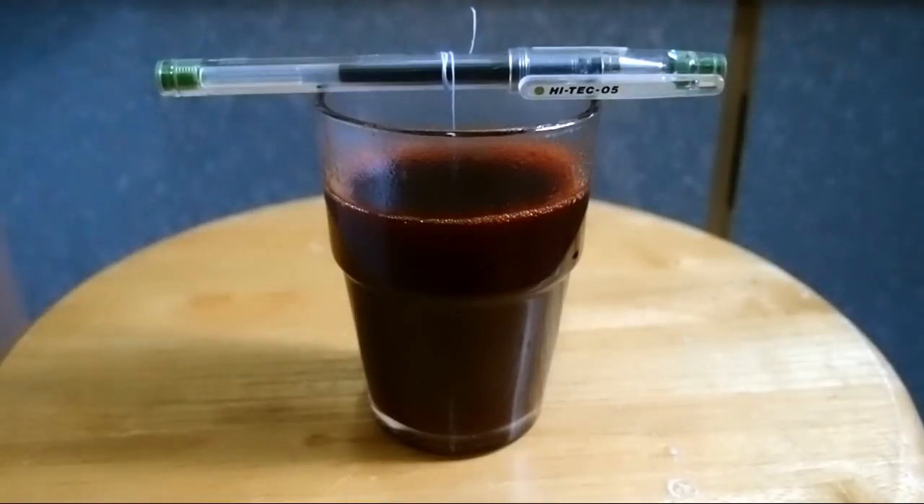Place the seed crystal in the middle of the container. You can place a piece of paper on top of the jar and wait for several days.